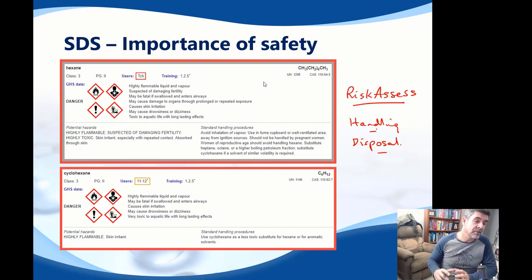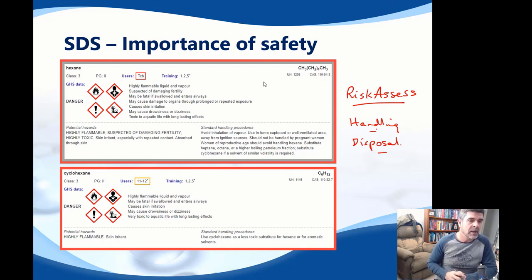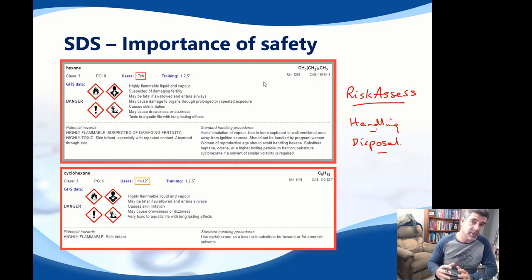There are a range of different organic compounds that we can use to demonstrate a range of different properties, both physical and chemical, but we need to make choices about what we're using in order to ensure that we are maintaining our highest possible levels of safety.